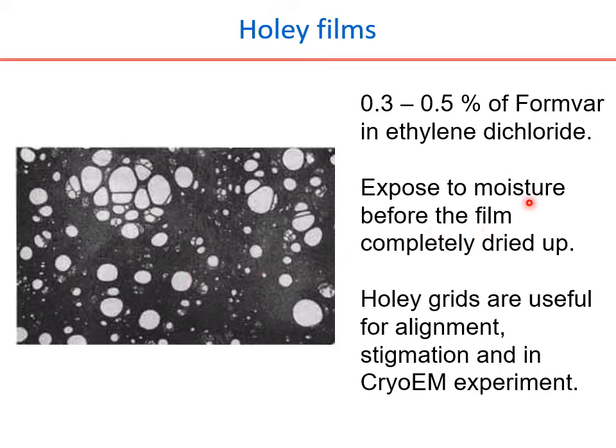So that means this is really a play between the moisture level and the rate at which you just swipe the slide before it evaporates. And again, there should not be any gap between the microscope slide dipping into the solvent and exposing it to the moisture. If there is too much gap between these two stages, the film is already formed and the exposure to the moisture is of no use. So you have to coordinate all these steps.